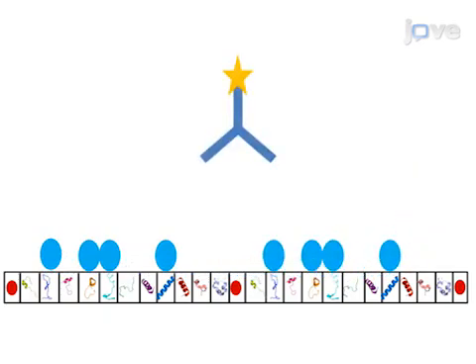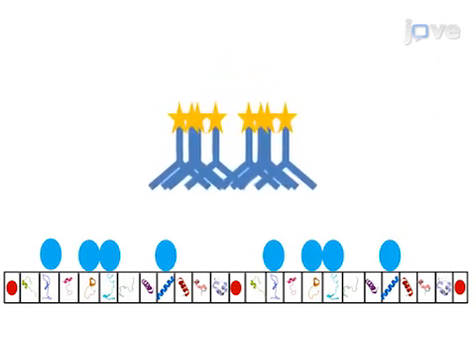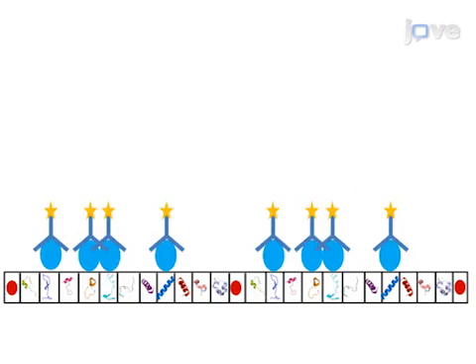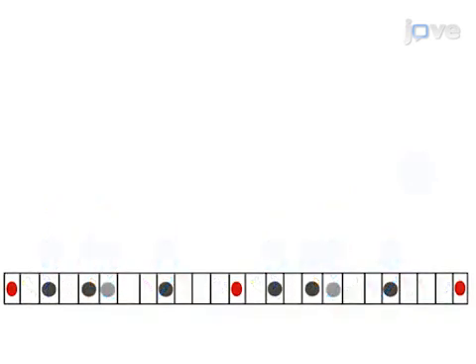Next, the array is washed and incubated with horseradish peroxidase conjugated antibody. The array is then subjected to chemiluminescence detection to detect the binding.